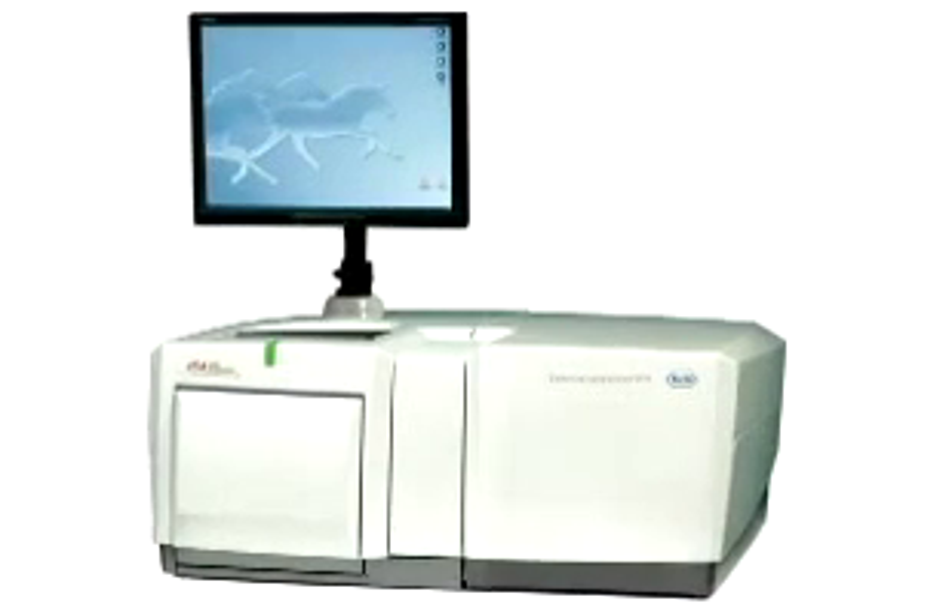Now let's talk about the other sequencing technology we're using. This is a 454 machine made by Roche.